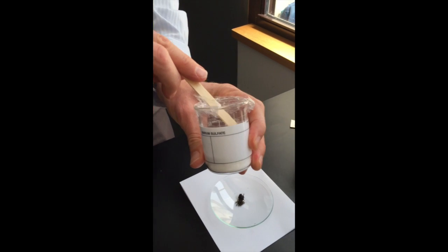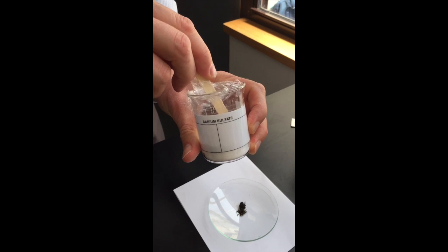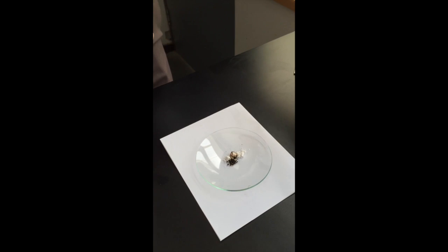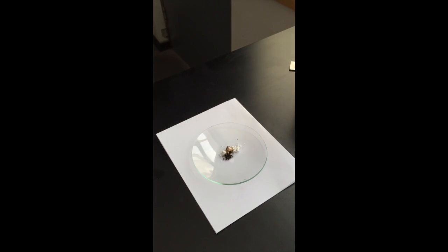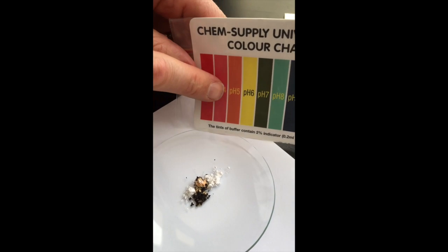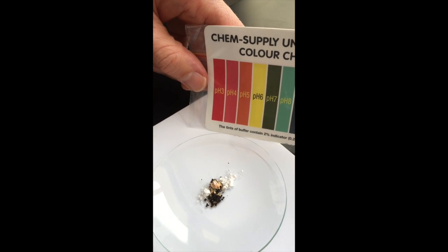Then get some barium sulfate and sprinkle a little bit of the powder over the top where you put the universal indicator, and watch for a colour change. When that colour change happens, get your universal indicator colour chart to determine what pH level the soil is at.